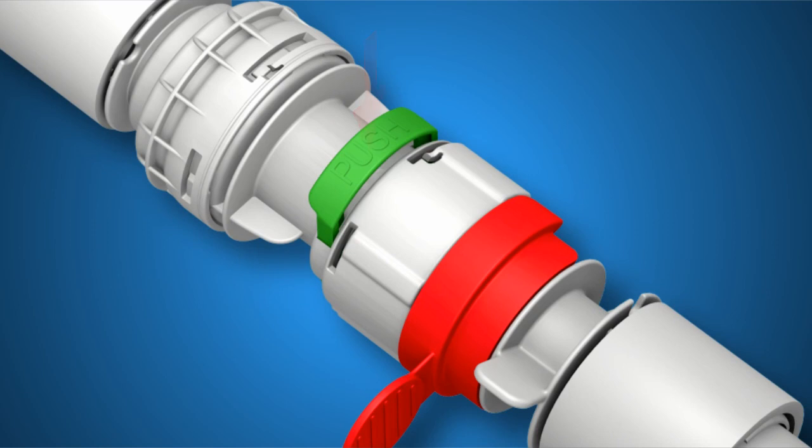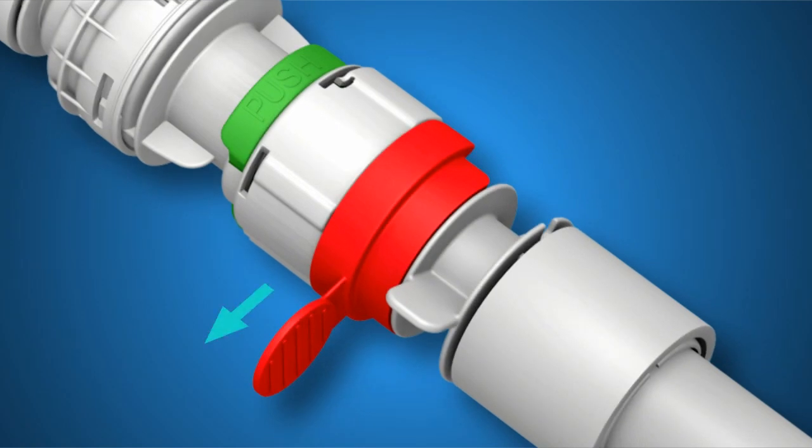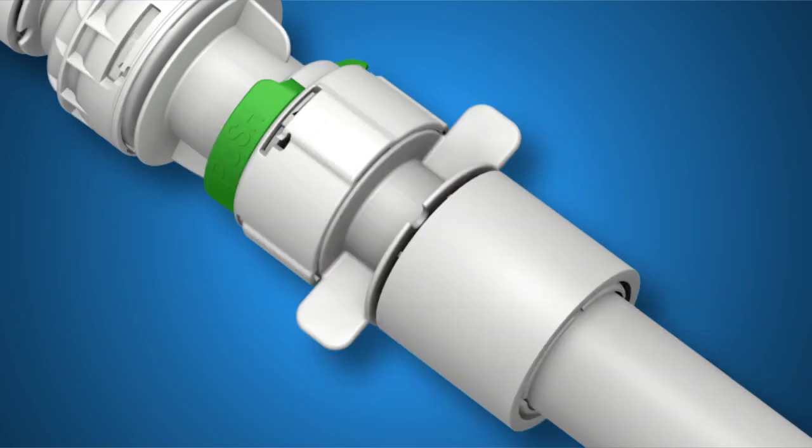Next, depress the locking clip against the inner housing with your thumb. Grasp the security clip tab and pull away from the inner housing. Now push the inner fitting into the inner housing until it stops. Finally, grasp the wing tabs of the inner fitting and rotate counter-clockwise until it stops.